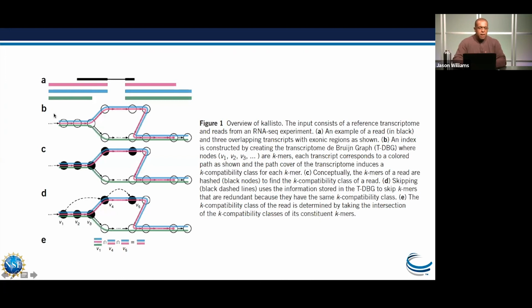So what you're actually seeing in this B, C, and D on the diagram is that we chop up the read into k-mers, short regions of the read, which we just take advantage of, and ask the question, could that small piece of the read, not the whole 150 base pairs, but maybe 30 base pairs, could that have been generated? Is it compatible with any given read? And in this diagram C, the first k-mer, let's say this region represented in this black dot, matches all three transcripts. The next one matches all three. But by that third k-mer, there is a match to the first two transcripts, but not a match to the last transcript. Without going into more sophistication or depth than that, I'll encourage you to read the paper.